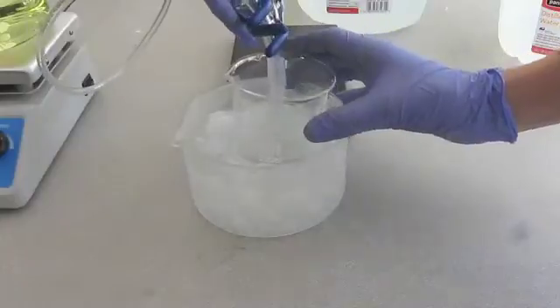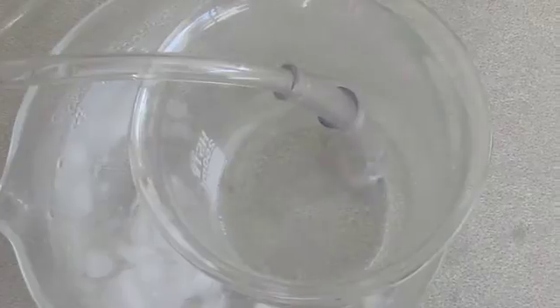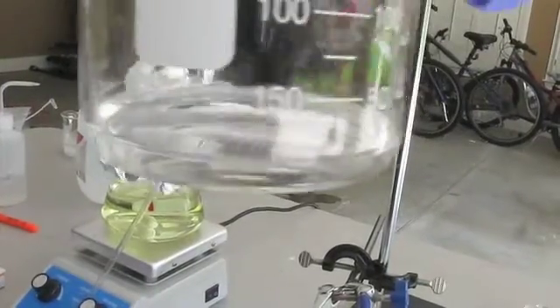The first time I tried this, I used a funnel as a suck-back trap. However, for some reason, this prevented any HCl from bubbling through the water in my receiving beaker. So I removed the funnel, and sure enough, I got a huge suck-back incident and lost about half of my product.